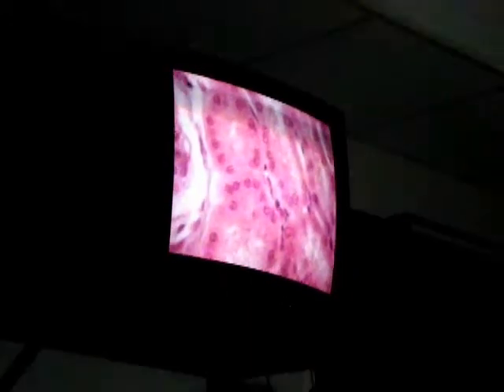About 99% of it will be reabsorbed there. So you want to have a lot of microvilli in order to do that reabsorption. Therefore, the lumen of the PCTs are going to look dirty. And these are PCTs right here. See, this is the lumen. Looks like it's almost filled. That's because the microvilli needed to reabsorb the nephric filtrate have extended into the lumen there.